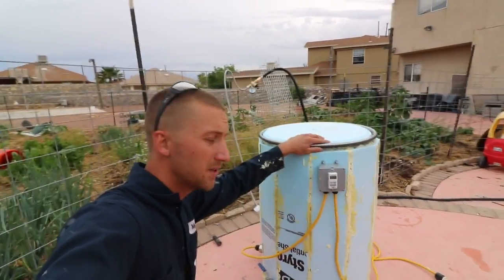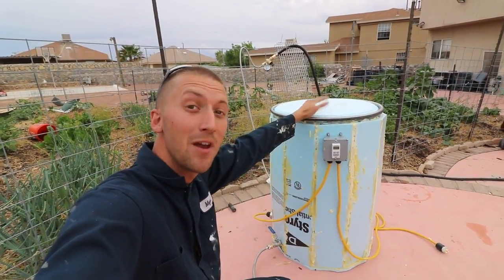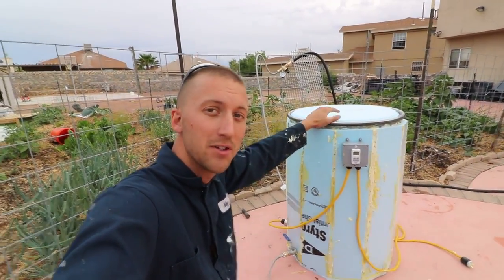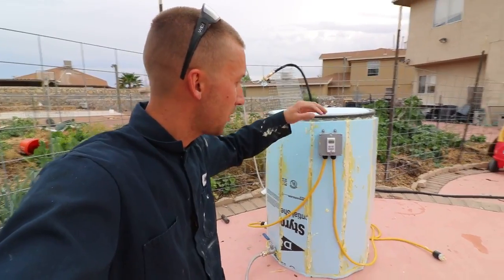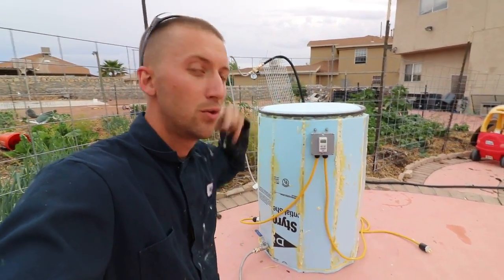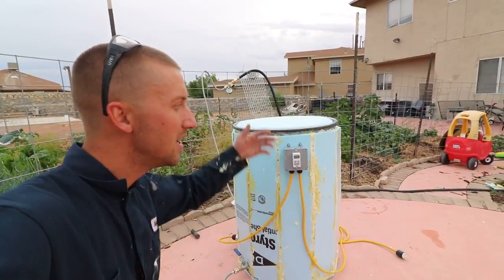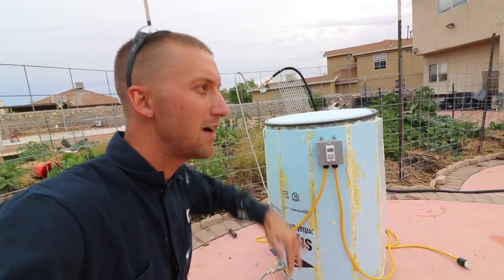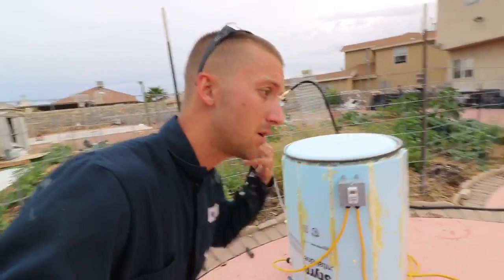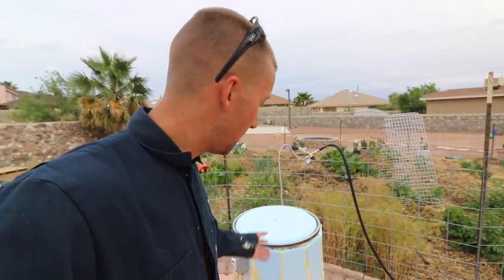If you have any questions or want to build this, hit me up — I'm more than happy to get back to you with answers. If anybody wants one of these built, Bubba's Barrels is actually going to be building them soon. They're going to build them with way better insulation, probably a PID controller or some fancier controller, and dual voltage — 120/240 — so if you want to run it at 5,500 watts or 1,500 watts you can, because it's the same element that runs on dual voltage. They'll be fully process controlled. Hopefully that'll be online in the next month or two — I'm working with them right now to get it online.